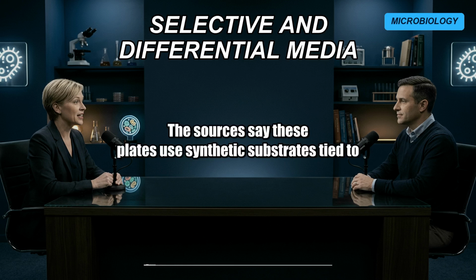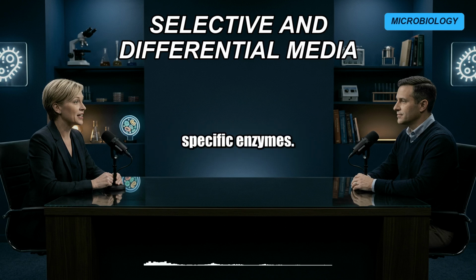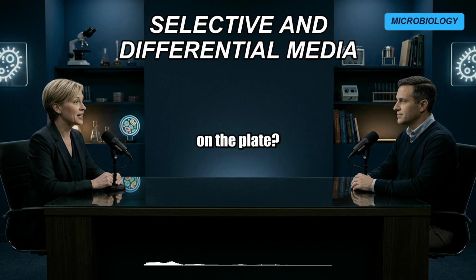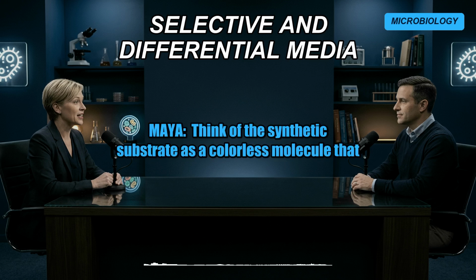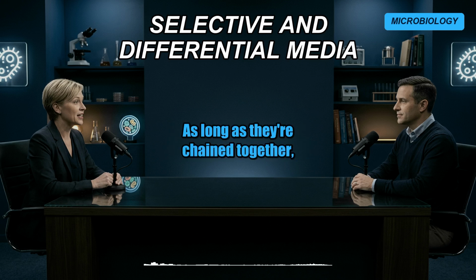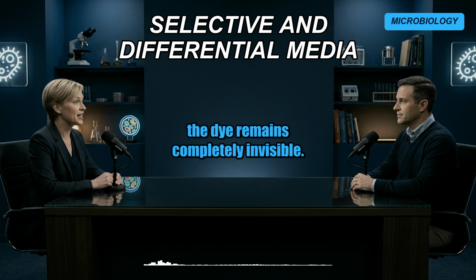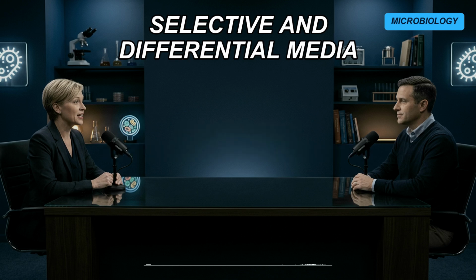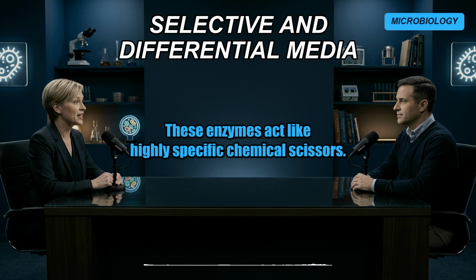The sources say these plates use synthetic substrates tied to specific enzymes. How does that actually result in a specific color forming on the plate? Think of the synthetic substrate as a colorless molecule that has a brightly colored dye tightly chained to it. As long as they're chained together, the dye remains completely invisible. Now, different species of bacteria produce distinct, unique enzymes. These enzymes act like highly specific chemical scissors.